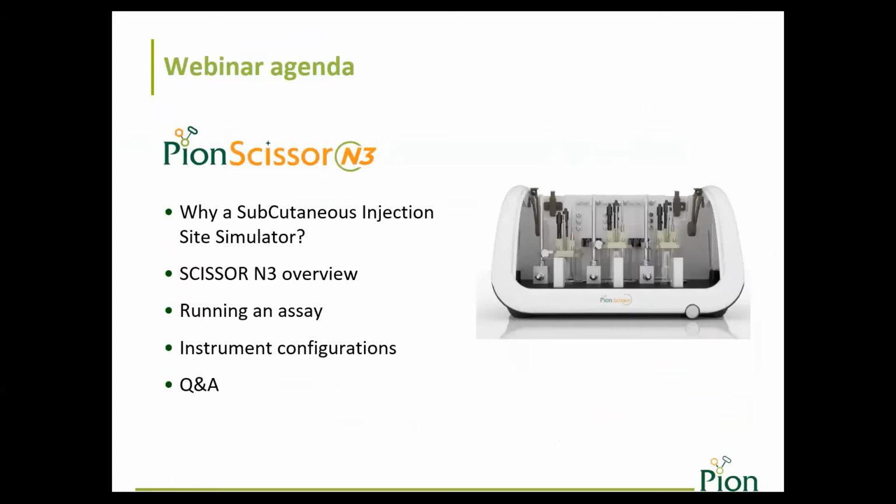Okay, so I'll cover in the next slide why we developed a subcutaneous injection site simulator, what need we were trying to fulfill, providing an overview then of the basic components and features of the SCISSOR N3, and then how it's used, how to run an assay, and what are the various configurations of instrument that's available. Next.